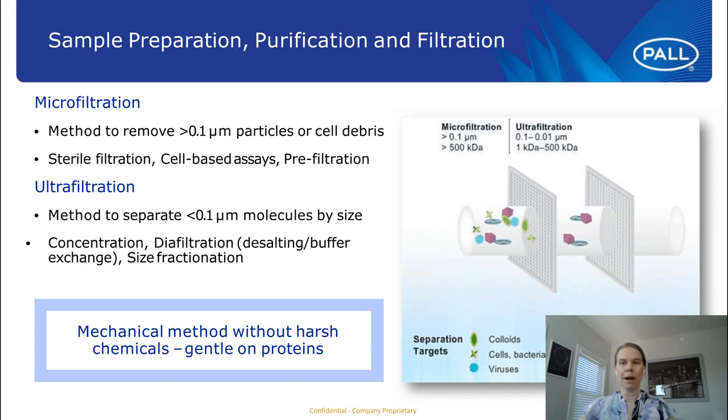If you look at some of the main applications for microfiltration, it would be pre-filtration, sterile filtration, and of course, cell-based assays. Whereas some of the main applications under ultrafiltration would be concentration, diafiltration, which is really mainly buffer exchange, as well as size fractionation.